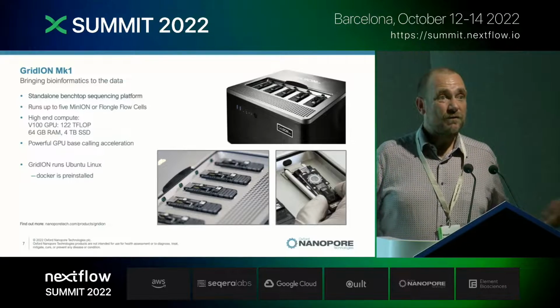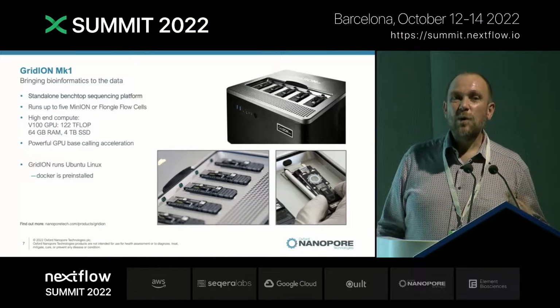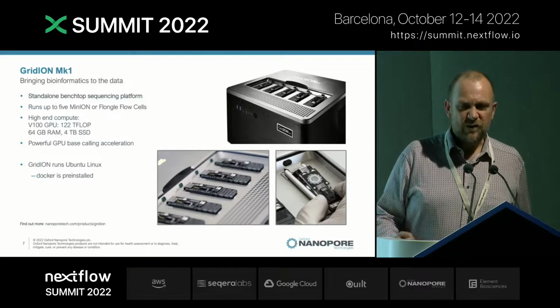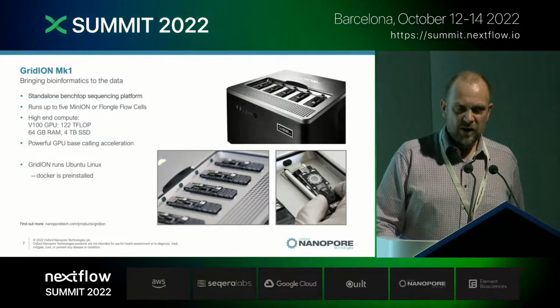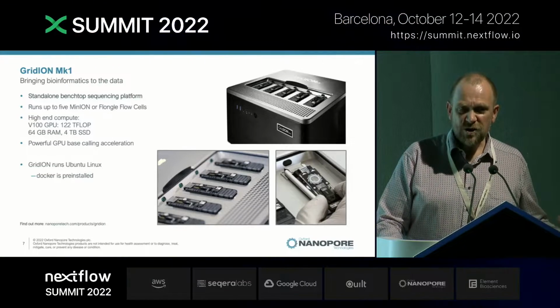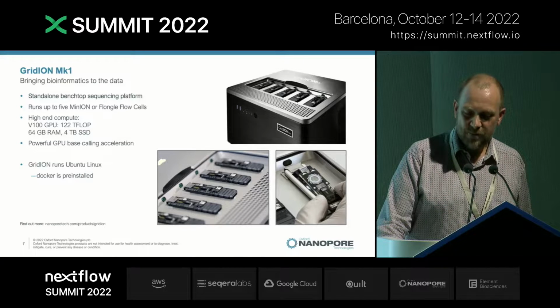Core facilities, as we've discovered, have all sorts of projects going on, so we have a platform here where we want to enable our users to start running slightly more ambitious bioinformatics workflows. How can we help our users help their users? How can we help the core facilities resolve the problems? So yes, can we implement something on the GridION device? And by extension, can we also enable other users, particularly MinION users, to use their own computers to perform bioinformatics analyses?